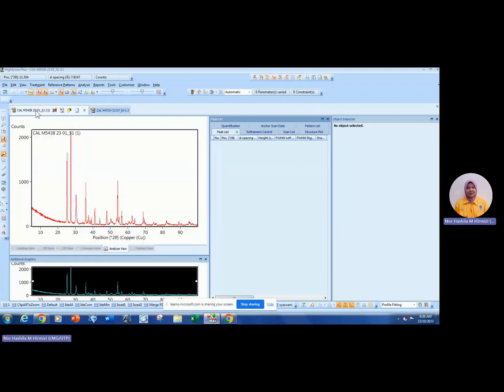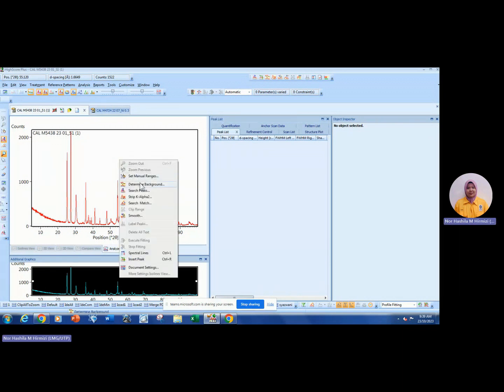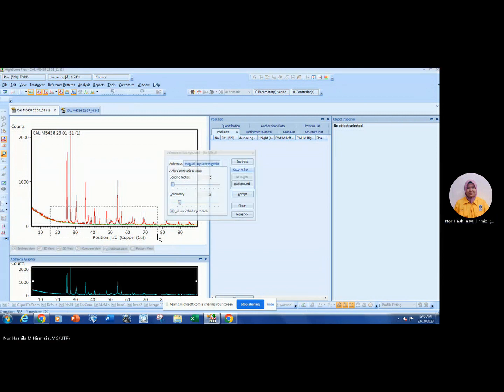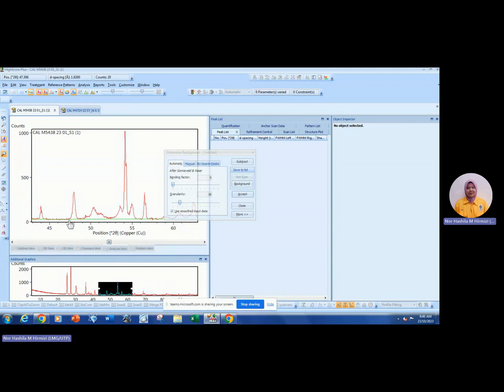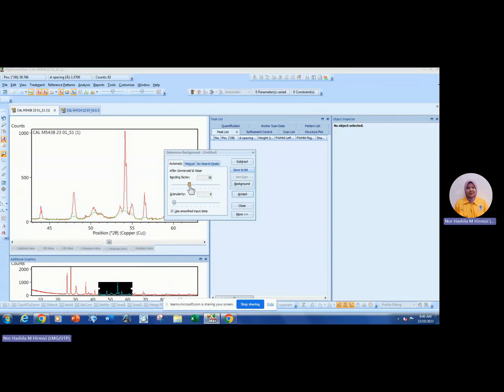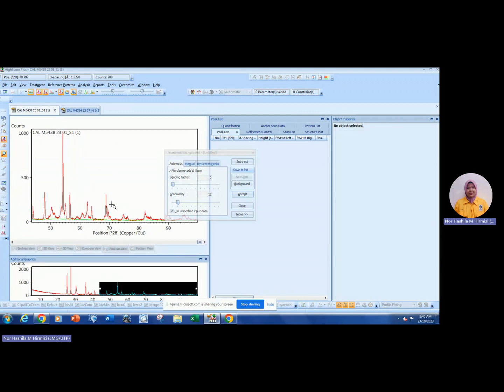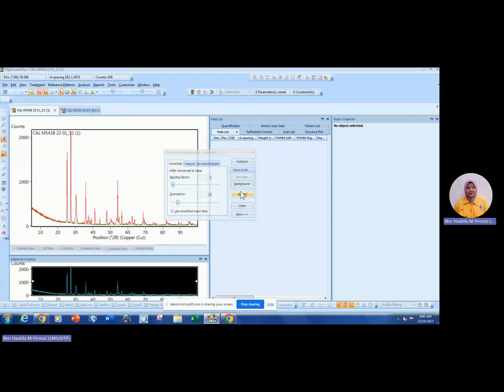The basic steps are four to five steps. The first step: right-click and click 'Determine Background.' You can see the green line at the bottom part of the graph. Adjust this value to make sure the line touches the bottom of the graph. Zoom out to make sure everything is at the bottom, then click Background and Accept.